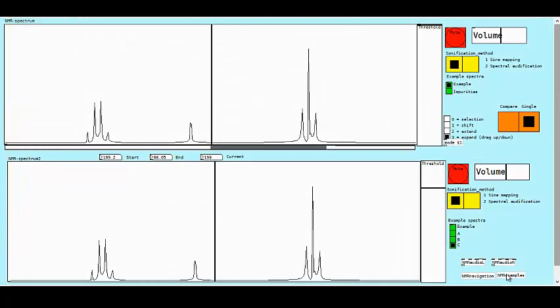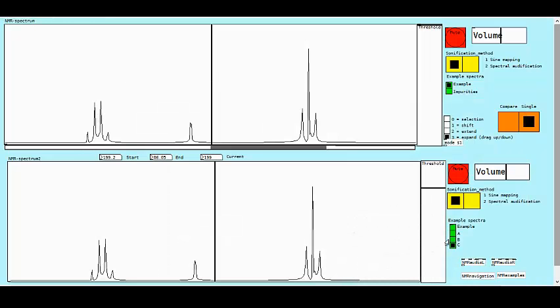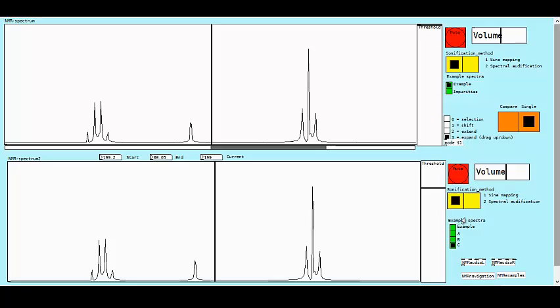Okay, finally there's the examples, and this quite simply just sends different files to both the arrays. So that's a very simple patch that just takes in the signal from these radios here and then uses them to select which files are in each of the arrays. So you can see here a bit of a crack when you switch, but that's okay. So yeah, that's the final system.